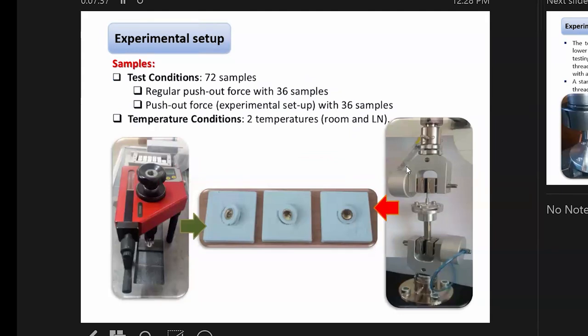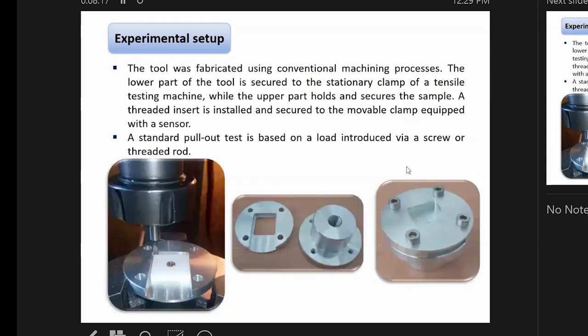Experimental setup: from the left side, you will see the standard regular push-out device, and we used 72 samples. From the right side, we used experimental setup with tensile test machine, placing in the lower chest our special tool to measure the pull-out test. You will see samples with brittle fatigue after pull-out test.